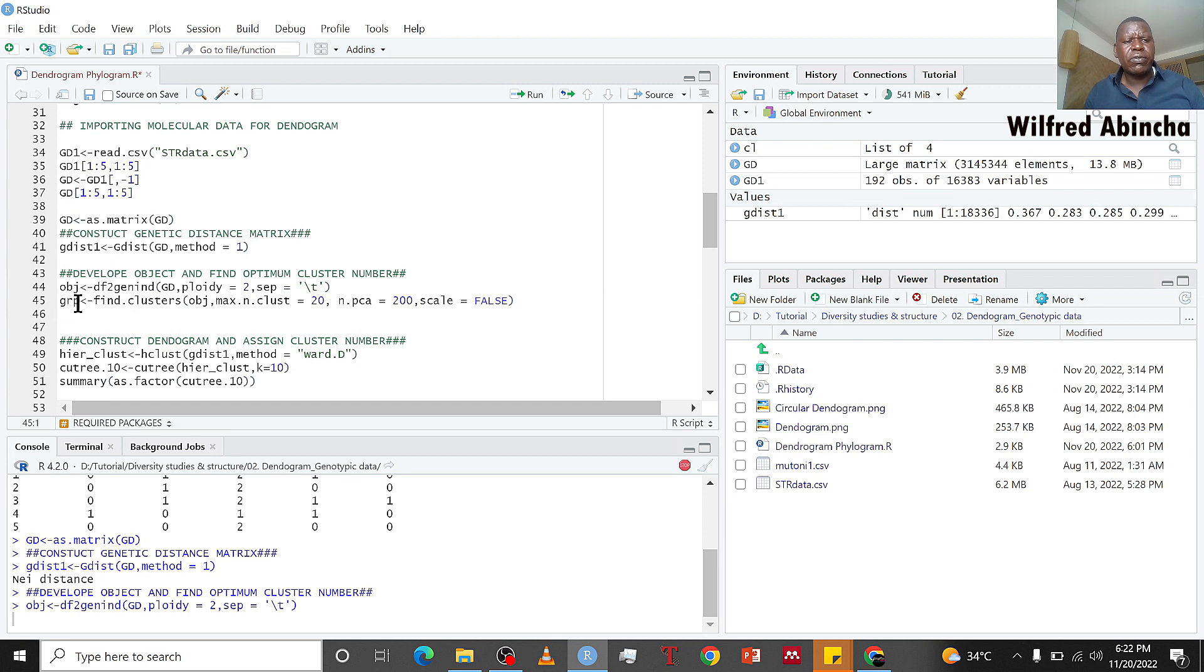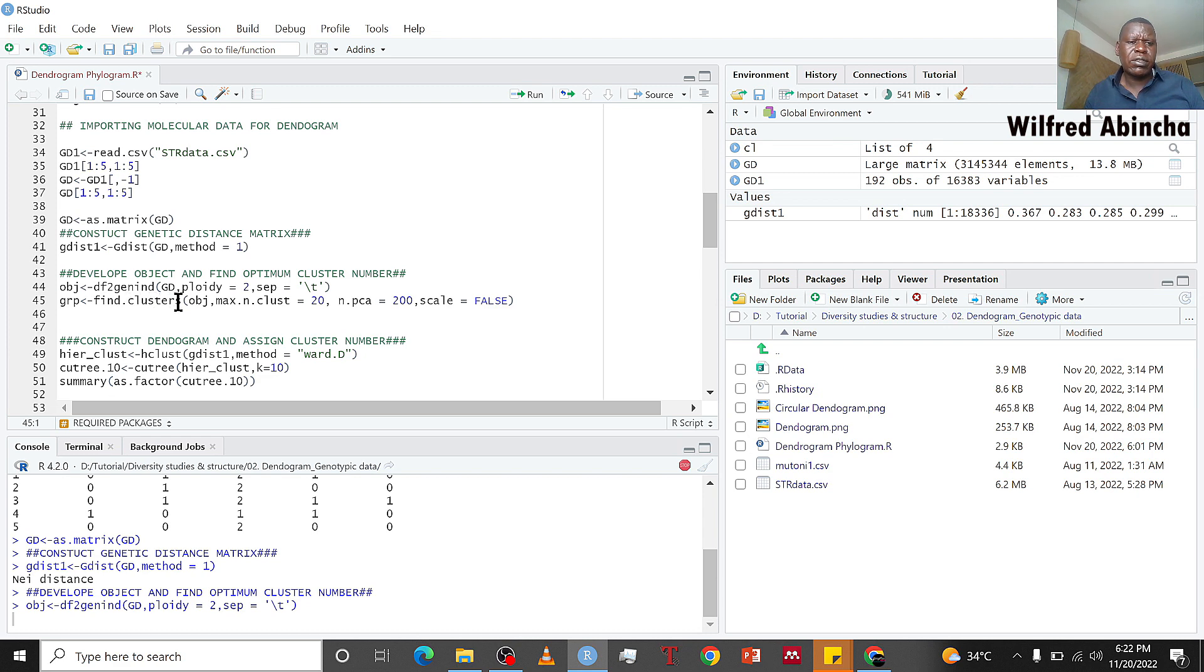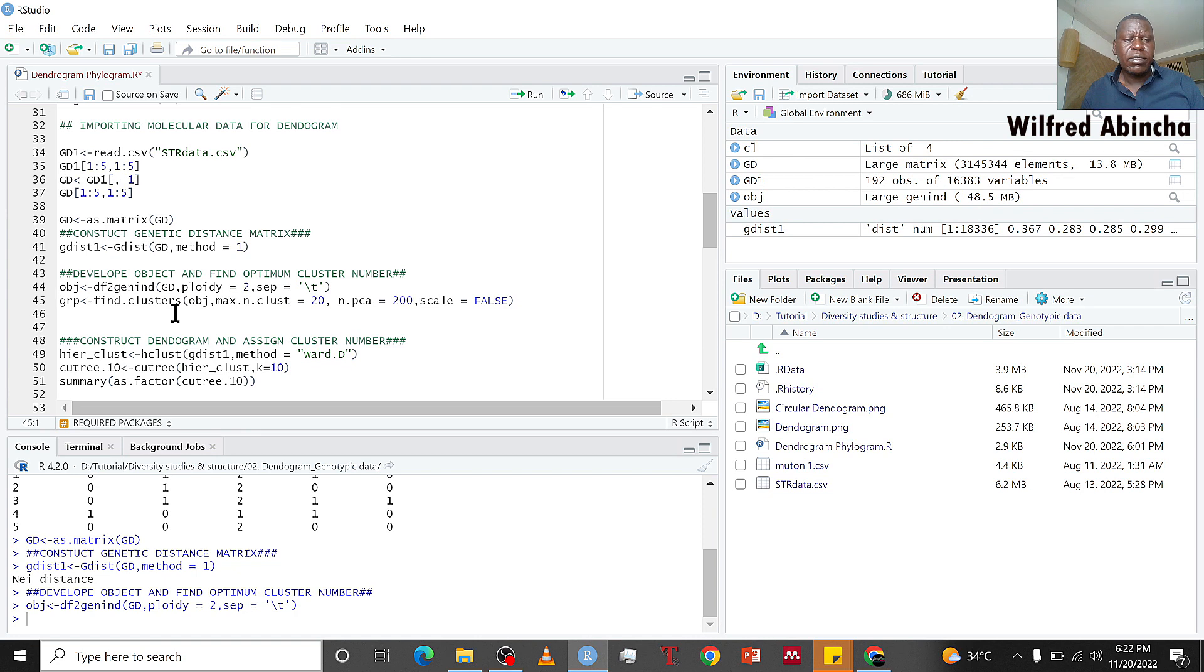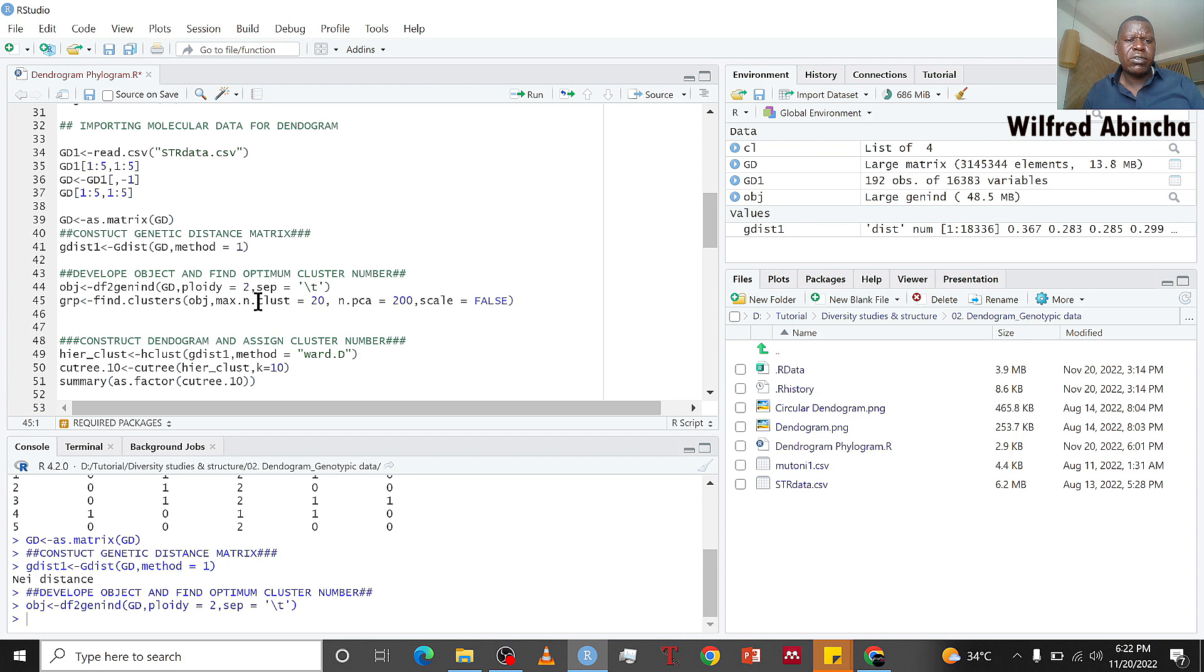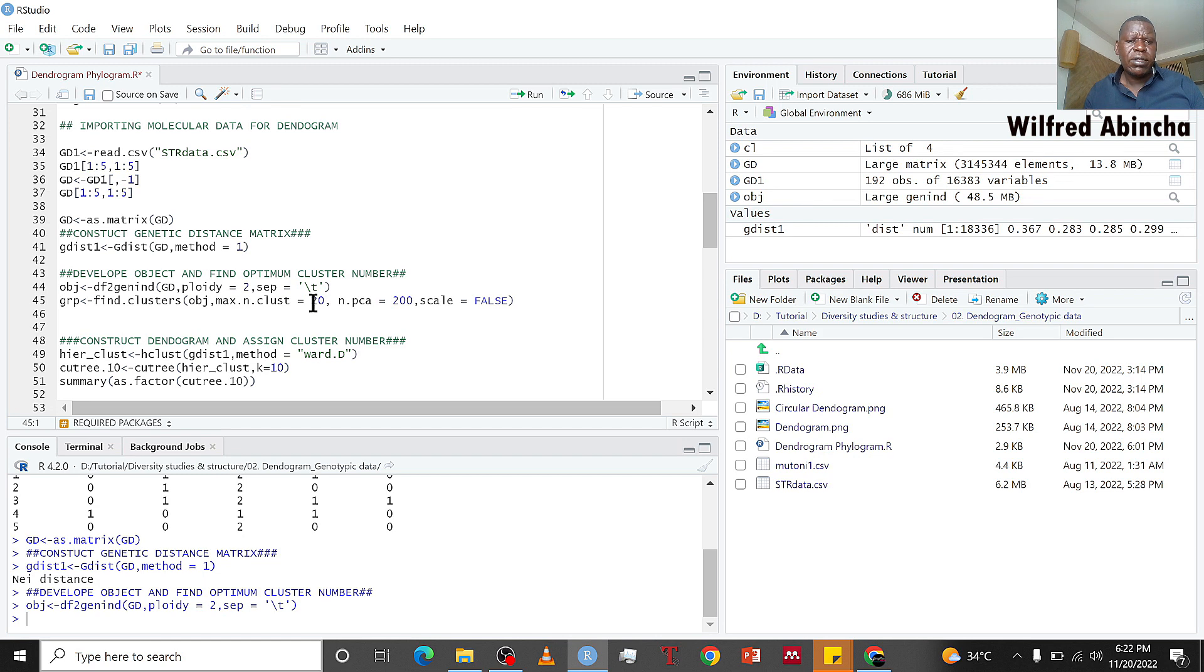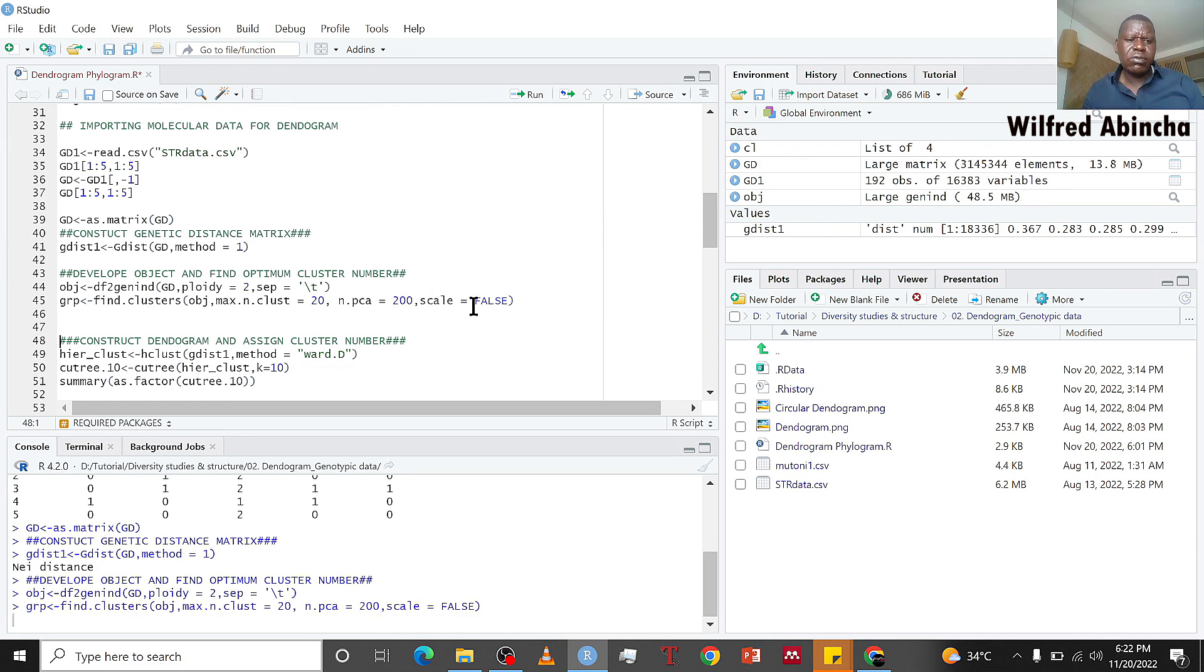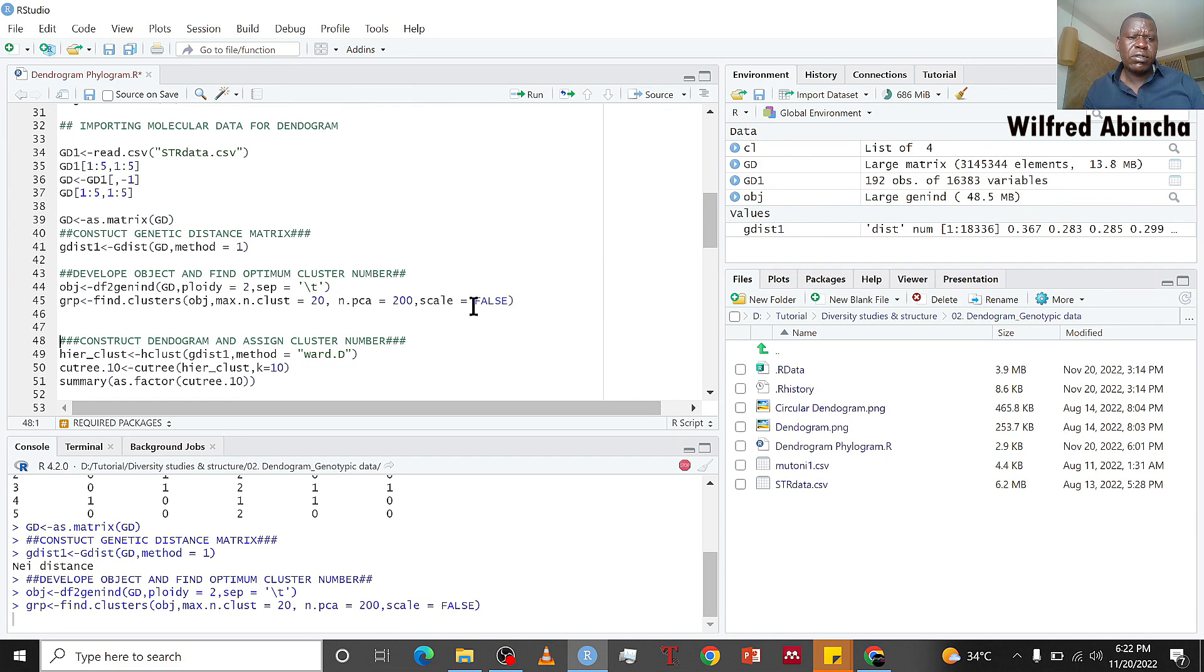We are going to use the find.clusters function to help us find the maximum number of clusters that represent our data. We are going to use the object we created and the max.n.clust is 20, the number of PCA is 200 because we have around 200 individuals, and scale is false.